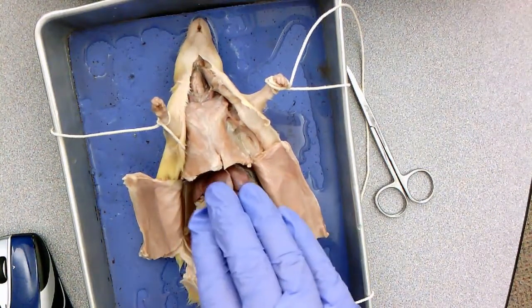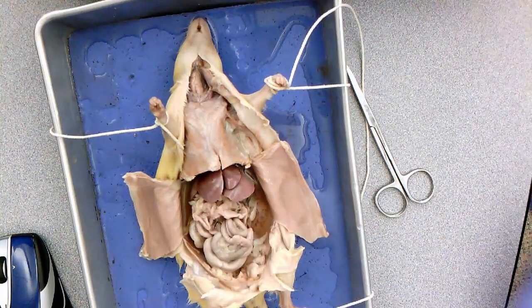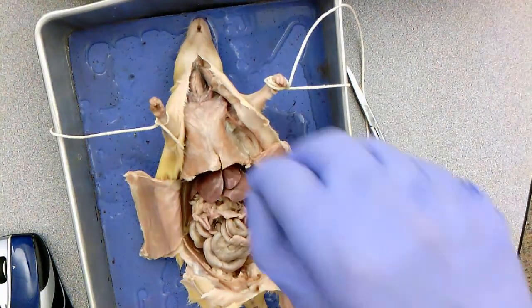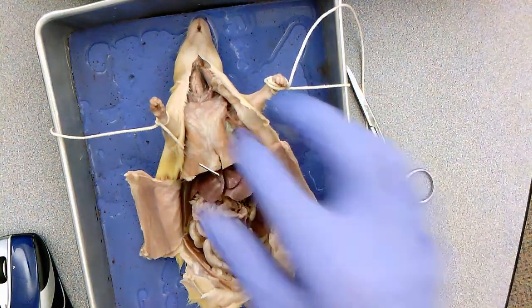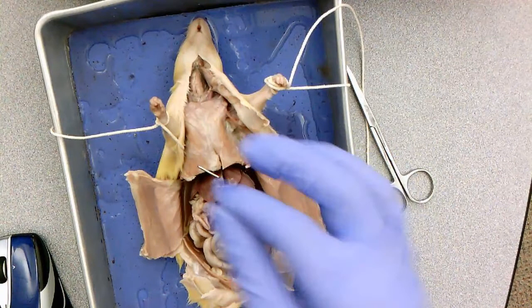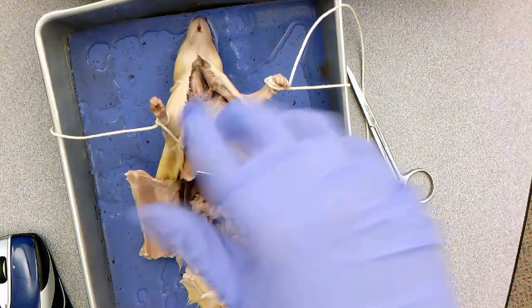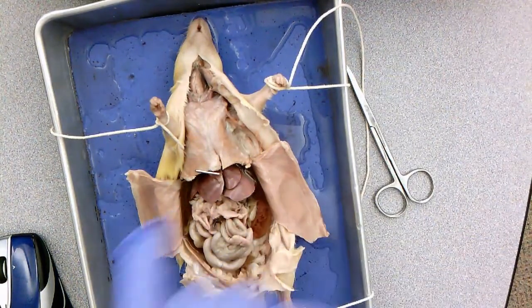All right, you have some key organs that you're going to have to identify in this region. Remember, when you identify organs, all you're doing is taking your pin and placing it in that particular region. Like I know that this is the liver, so I'd place this on here. I would have a little piece of tape on this, and it would say liver. So you're going to identify some of these key organs that are in the abdominal pelvic cavity.